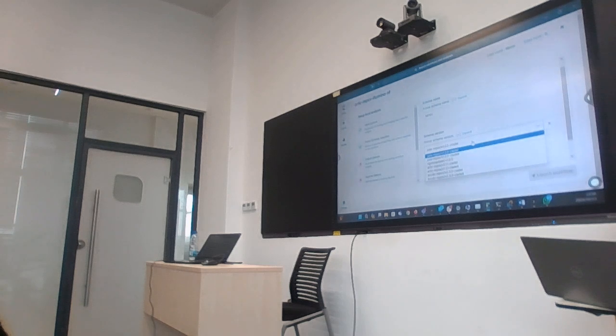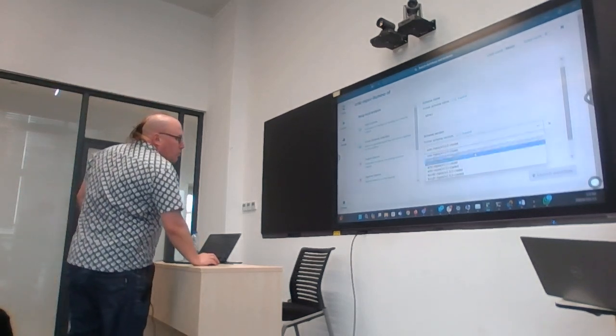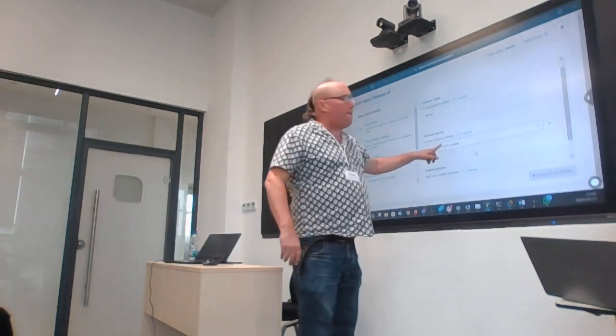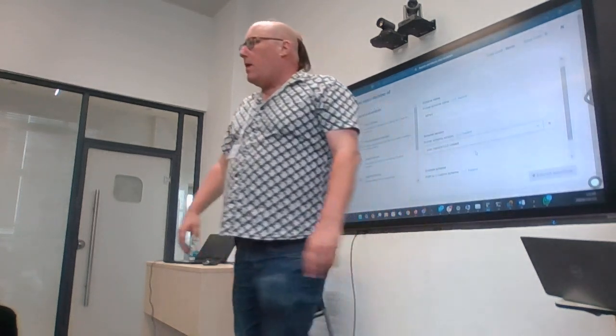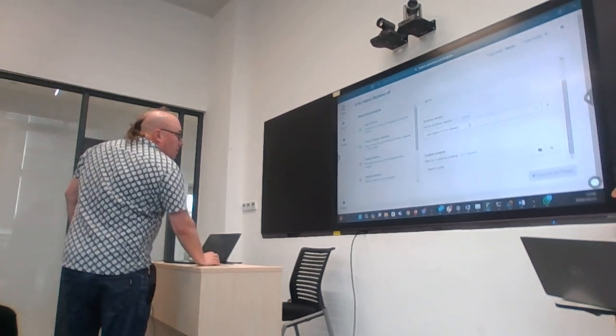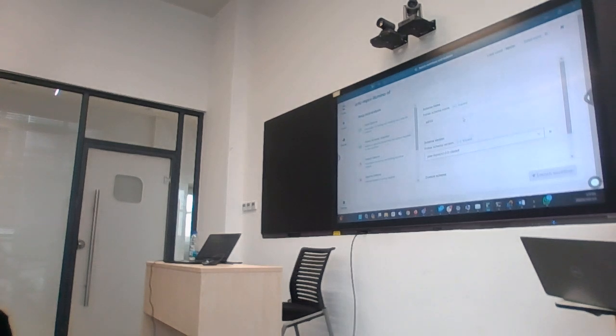Yeah. I've added some extra primers, yeah. And there's actually a multi-clade primer scheme in development from the Arctic people. So we choose the clade 2. So we're choosing the Yale 1.0 with the clade 2 reference, okay, as our primer scheme. The other stuff is if you've got a different primer scheme that's not listed here, but we don't. Okay.